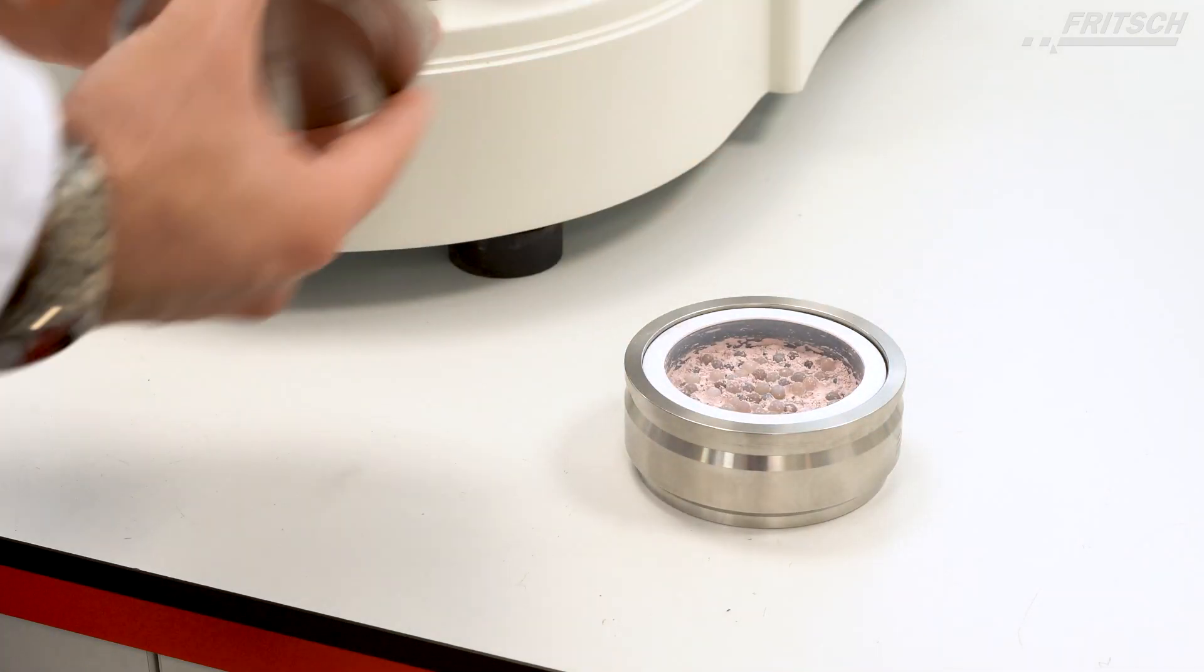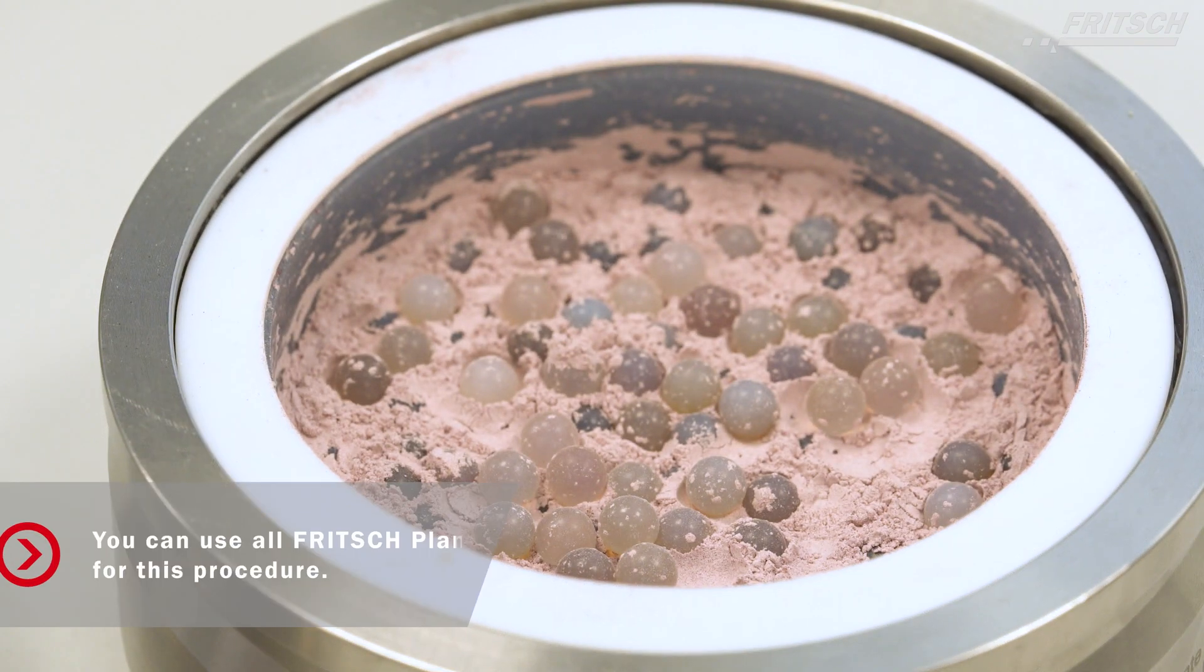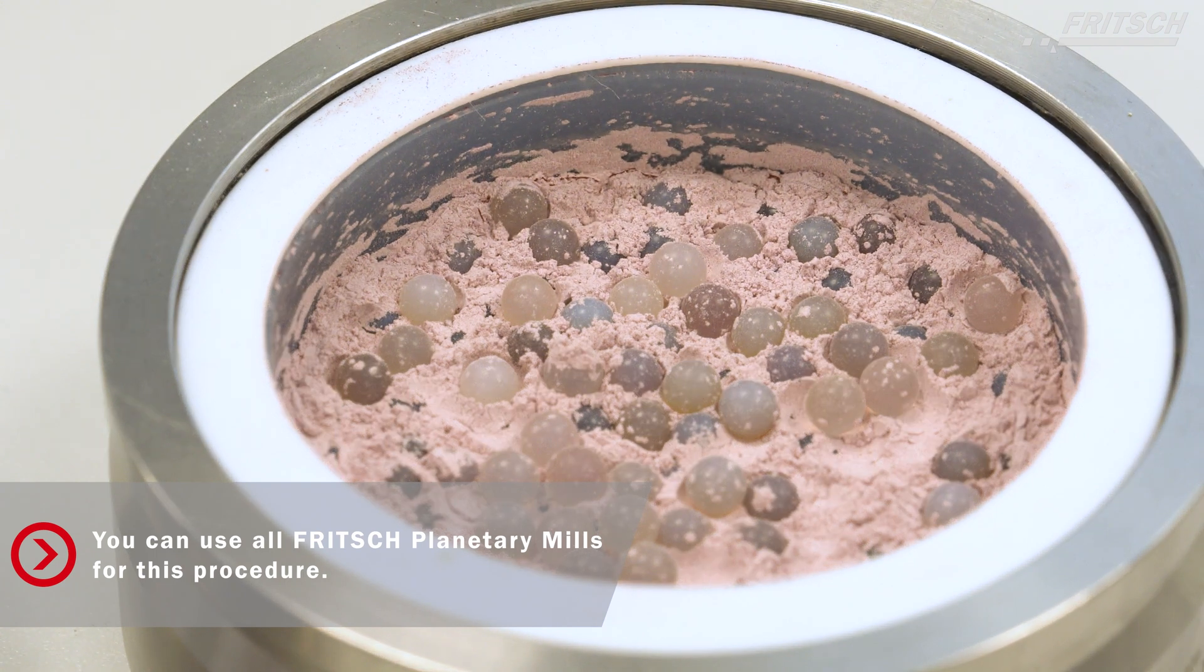Now you have a perfectly homogenous mixture of two samples using a Fritsch Planetary Mill. You can use all Fritsch Planetary Mills for this procedure.